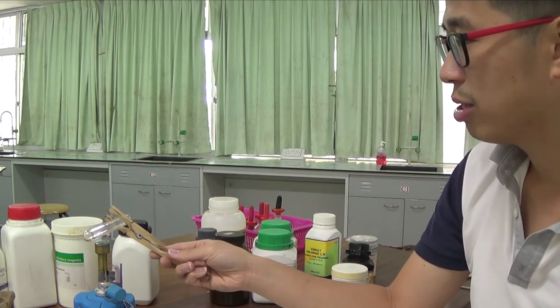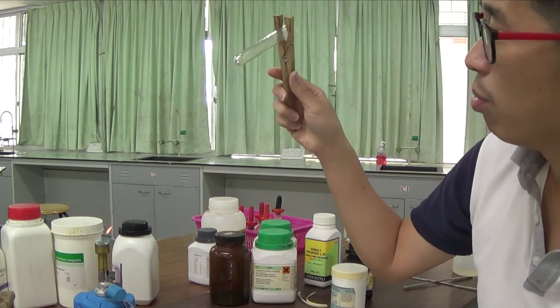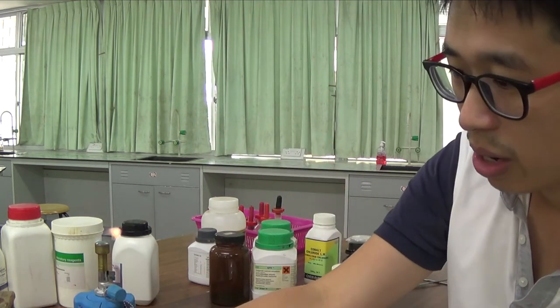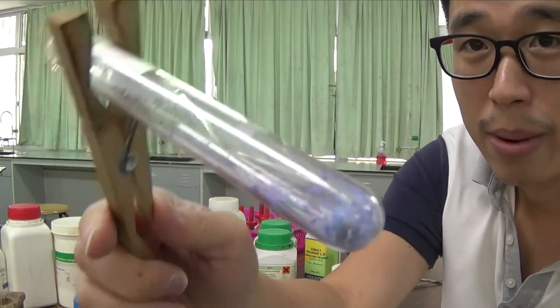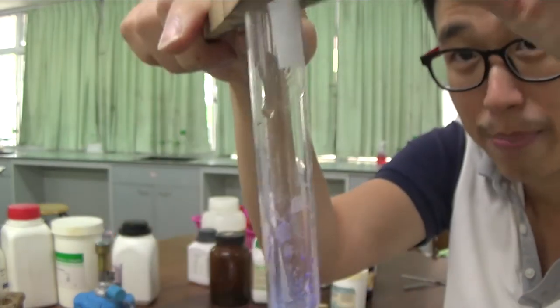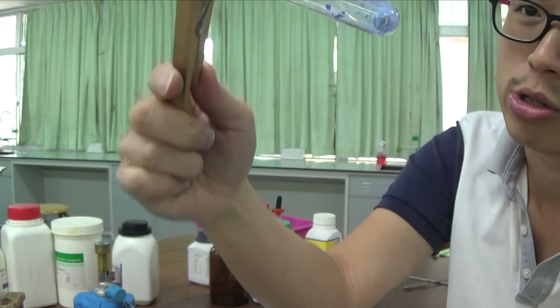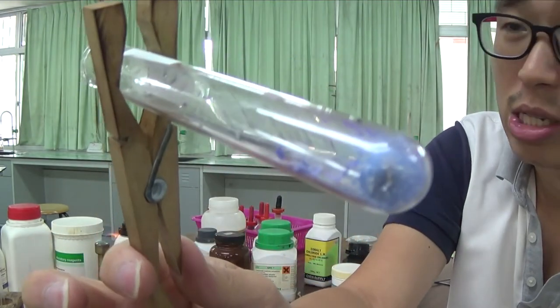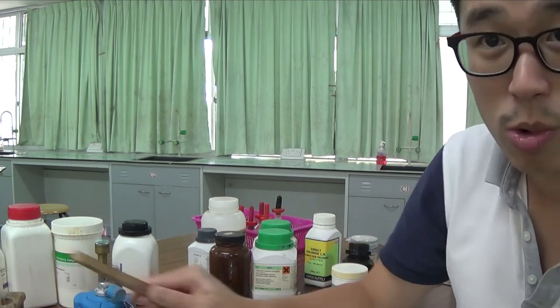So I just want to get rid of the water, really, and I'll come back and add water to it and see what happened, okay? So this was my blue color cobalt just now. The upper part already gone pink a little bit, maybe because when I put it under gravity, the liquid water actually drops back down and it turns it into pink again. But majority of it is still blue. It's still pretty hot, so I don't want to add water to it just yet.